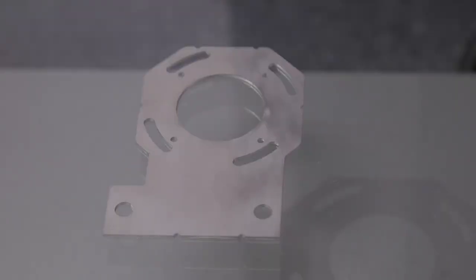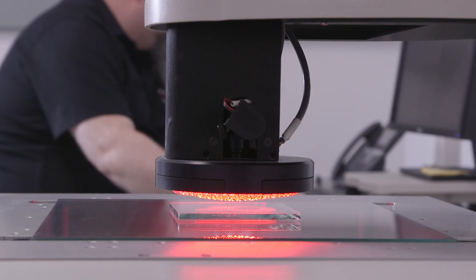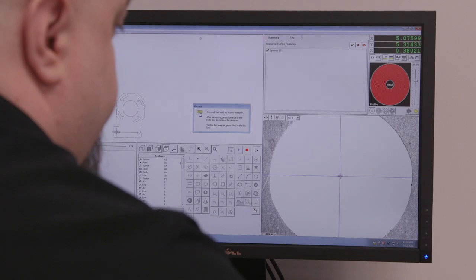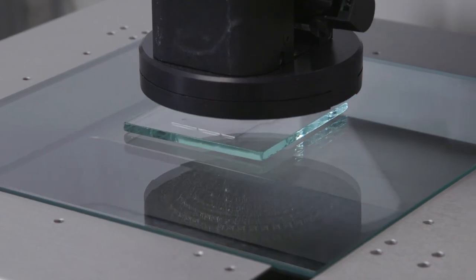This is another one of our visual inspection systems. This particular part is a stainless steel part cut on a fiber laser using an IPG laser cube. We take the DXF information, download it into this software, and we can inspect for hole size and positional accuracy to whatever tolerancing we deem appropriate.